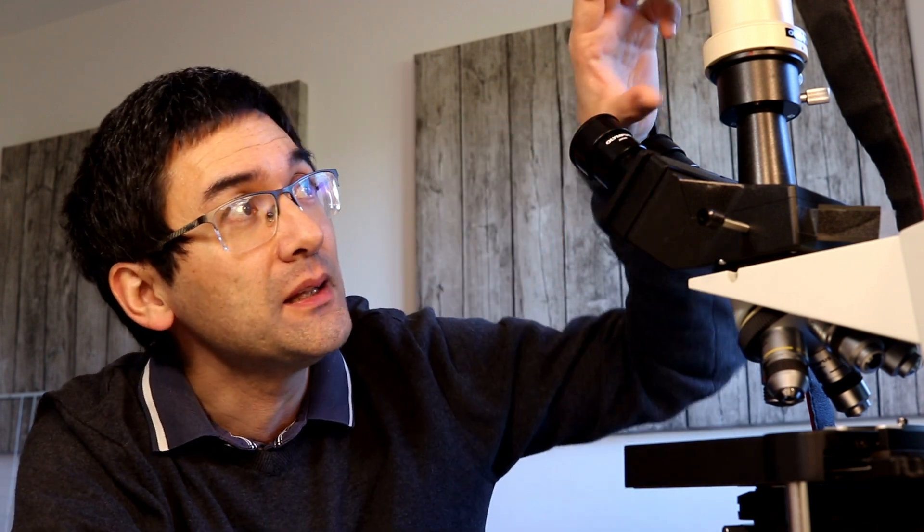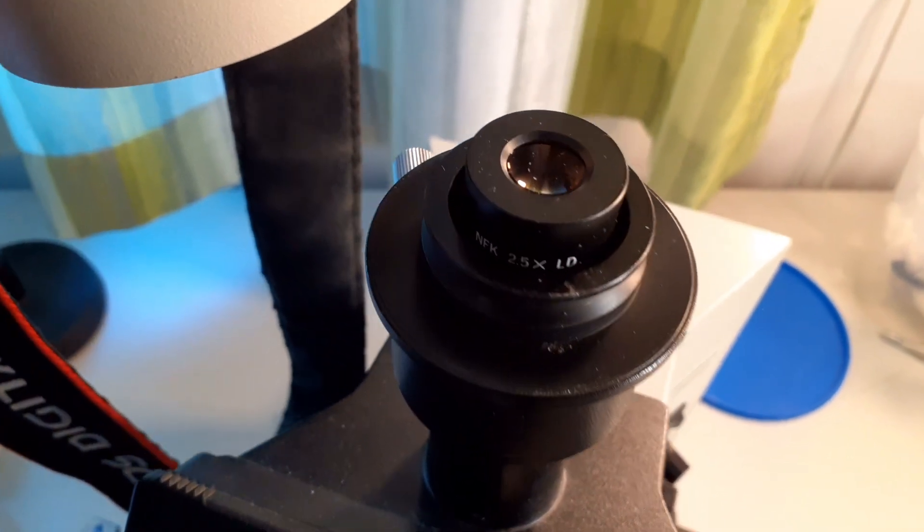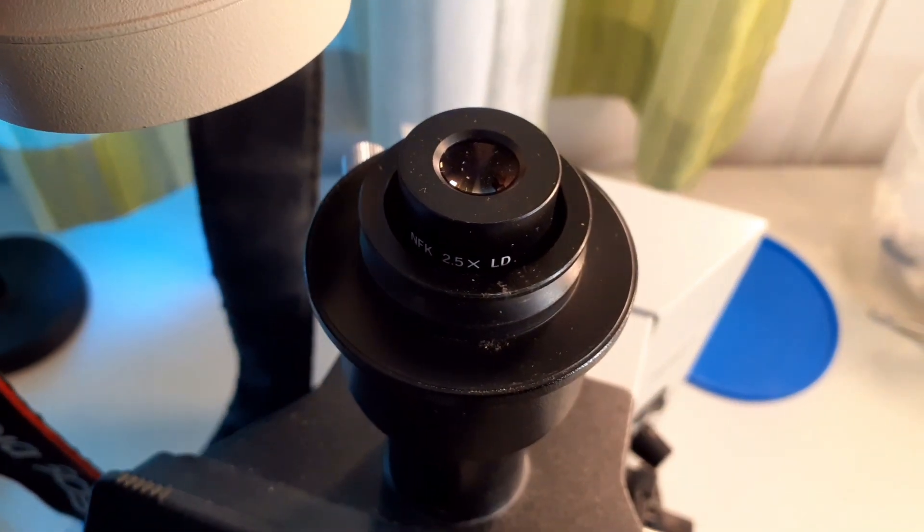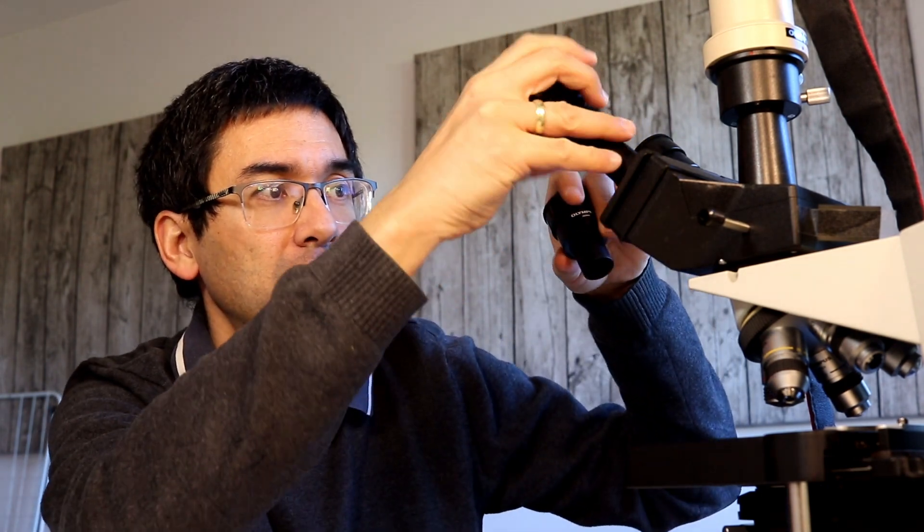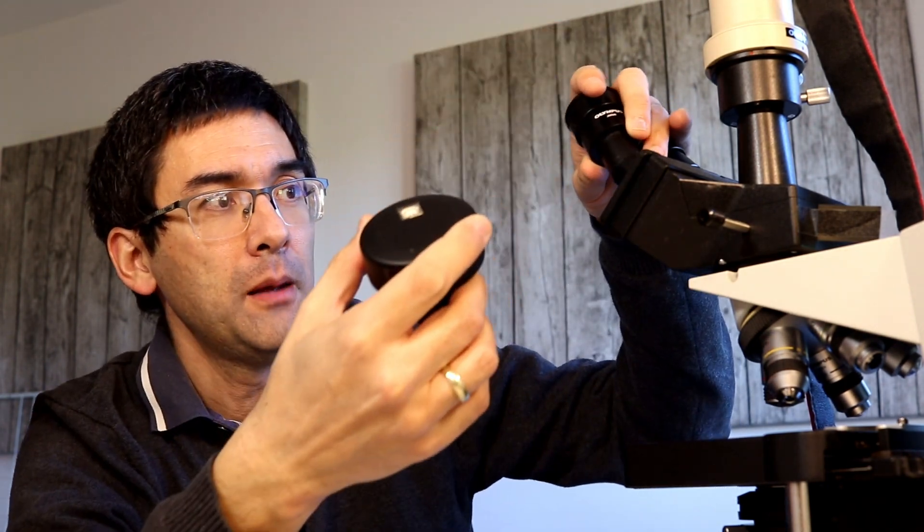But there is one thing that one has to consider a little bit when trying to connect the DSLR camera: you need a proper adapter. Now in my case, this adapter is an original Olympus adapter, and there's also an intermediate optics in here which is designed to be used for DSLR cameras. So the whole system works together quite well, and I'm getting a pretty good image quality. If you buy yourself a microscope camera, then it also comes already with an optics that is designed to actually work well with the camera. In this case, it's just an eyepiece camera where you just plug it in here. You can also put it in at the top.